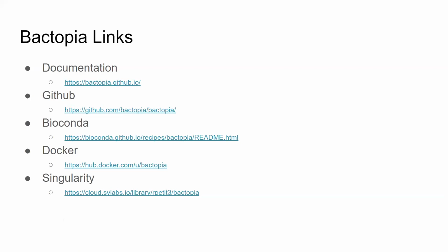Yeah, so how do we categorize? It's a combination of read lengths. So we're dealing with the Illumina data, but we're also dealing with public data, which still includes some of those older Illumina sequences, which were only like 33 or 36 base pairs. So we're including everything in this analysis, at least. One thing I should say though is these parameters are adjustable by the user. So if you don't agree with my thresholds, guess what? You can change them. Done.